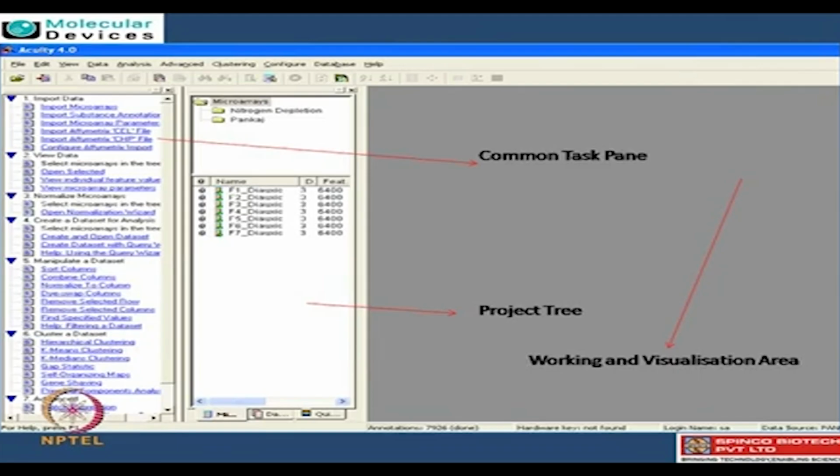Okay, I guess now we can actually look at the real software and the data demonstration, so that we are very familiar with the stepwise analysis. Sure. So, Pankaj, in the last lecture when we talked about GenePix Pro, you showed one e-slide, how to scan that e-slide by using the GenePix Pro software. I guess now it will be good if you can use the same slide that we scanned in the last lecture and see how we can analyze it here.